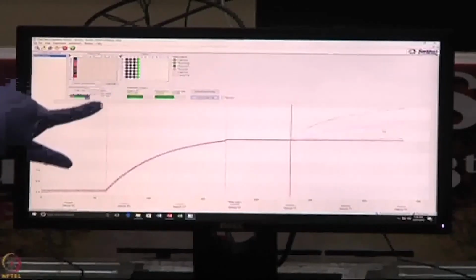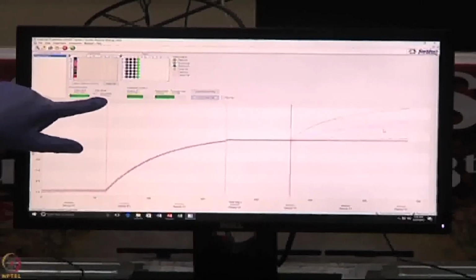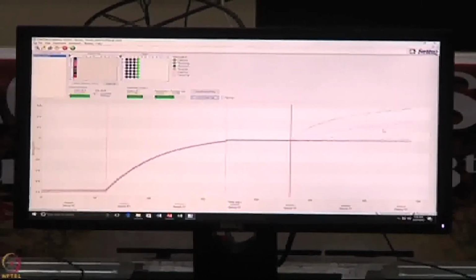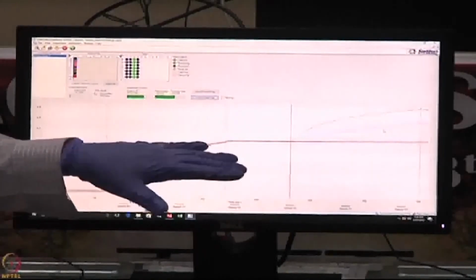I forgot to mention, we are working with 1000 RPM. We have a shaker range working from 100 RPM to 1500 RPM. Depending upon the application, we can choose the right RPM. Generally, when we are working with kinetics experiments, we go with 1000 RPM by default. When we do quantitation experiments, we generally work with 400 RPM, where we are working with microgram level concentrations, like 200 to 1 microgram. When you are working with concentrations like in kinetics experiments, we go with the higher RPM.